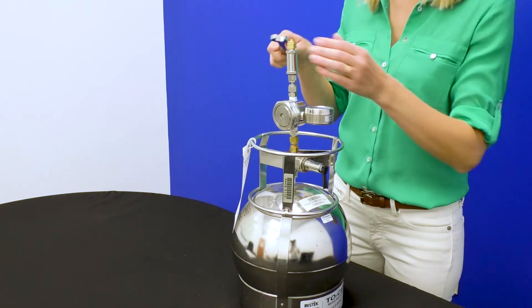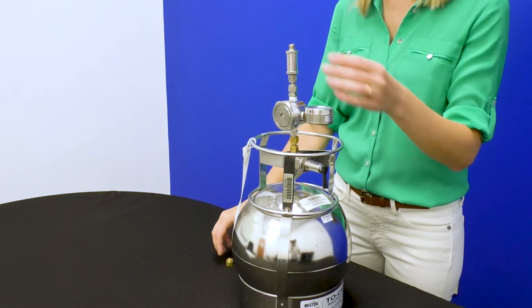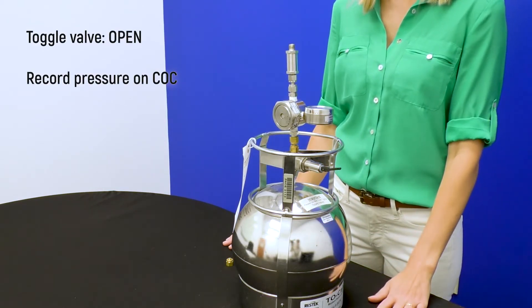When you are ready to sample, remove the brass cap from the top of the flow regulator by turning counterclockwise using a 9/16th inch wrench. Attach any tubing as needed with the included fittings and ferrules. Then open the valve and record the initial pressure on the chain of custody.